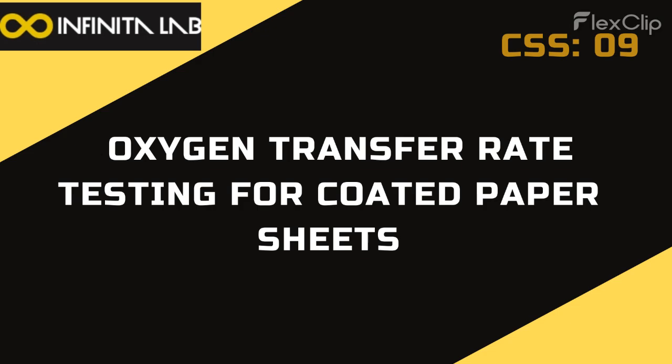So that ASTM standard sounds serious. Did the company in our case study, did they have all the stuff to do this test themselves? So actually they didn't. See, testing for oxygen transfer rates needs super specialized equipment and a lot of expertise. It's not something you can just DIY, unfortunately. Right. Yeah, that makes sense.